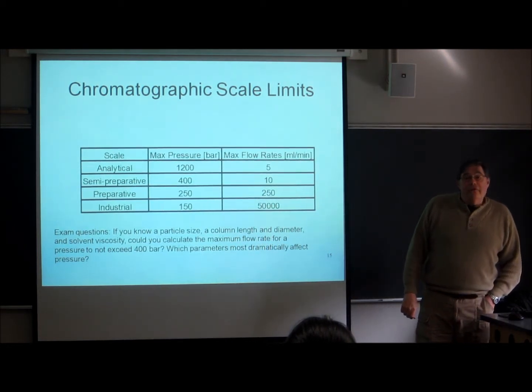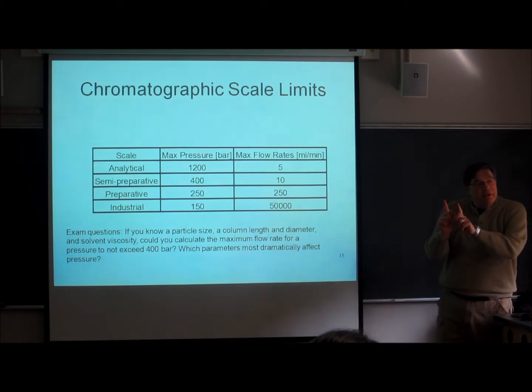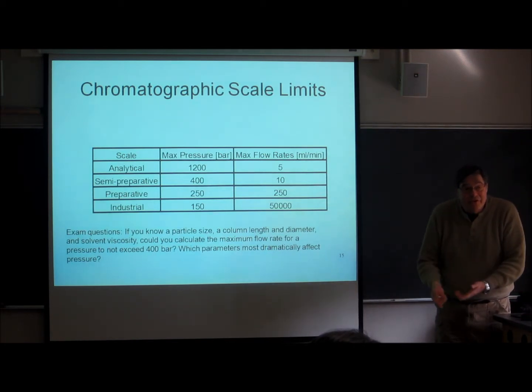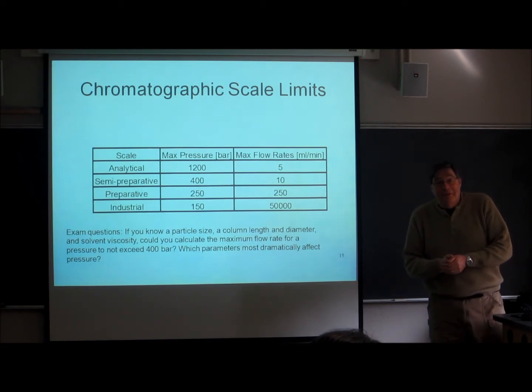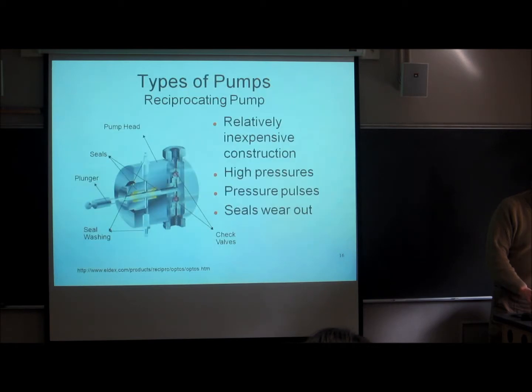Now, there's a new class of instrumentation called ultra high, or even bigger. And of course, that means that those close peaks are going to get a little bit harder to separate when you have to use a less efficient column. Just keep that in mind. There's a lot of good stuff that the chromatographers can contribute to the use of these different kinds of instruments.